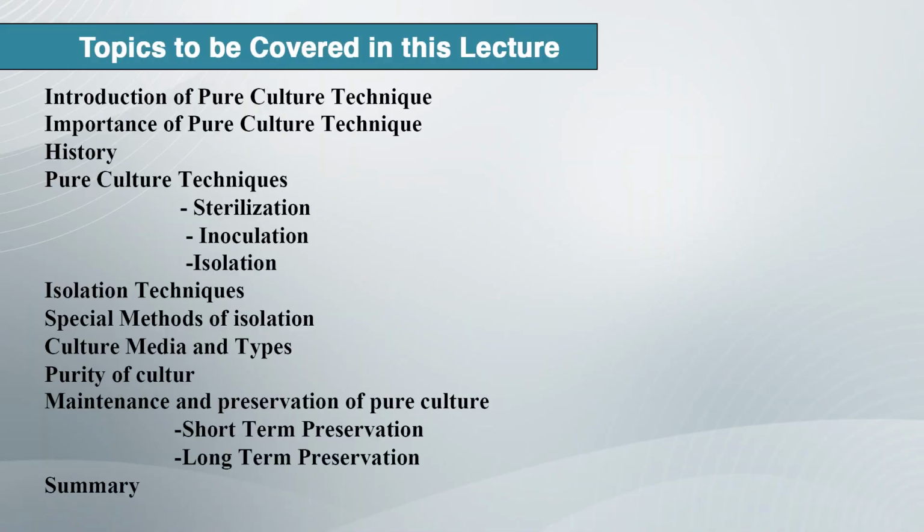Now, in the current topic we cover the pure culture technique: an introduction to the pure culture technique, its importance, its history, the pure culture techniques under that, sterilization, inoculation, isolation, then isolation techniques, a special method of isolation, culture media and types, purity of culture, maintenance and preservation of pure culture by short term preservation and long term preservation methods, and its summary.